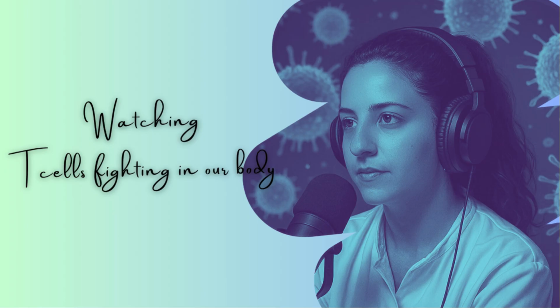So basically, flow cytometry gives you a window into the immune system that no other method can, which is amazing. And we're not just guessing what cells are there, we're seeing who they are, what they're doing, and how they're feeling, all in a single experiment.